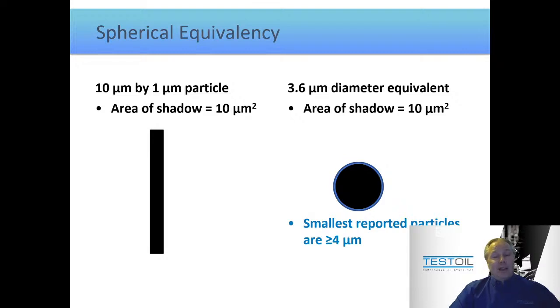So that particle actually goes unreported. So as you can see right away, the correlation between elemental spectroscopy measuring most accurately particles under 5 microns and this test reporting particles greater than 4 microns, which in effect are really actually kind of larger than 4 microns, already shows you that you should not expect much of a correlation between these two sets of results unless you've got a broad range of particle sizes.